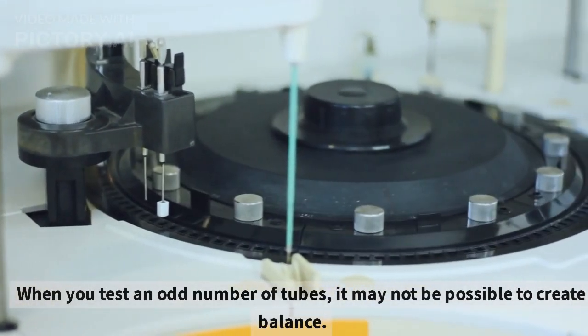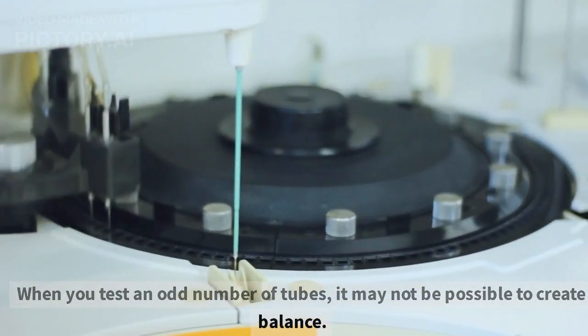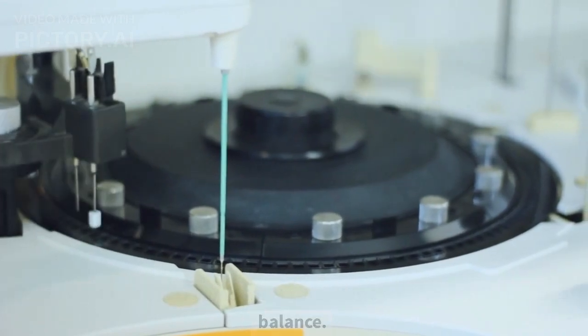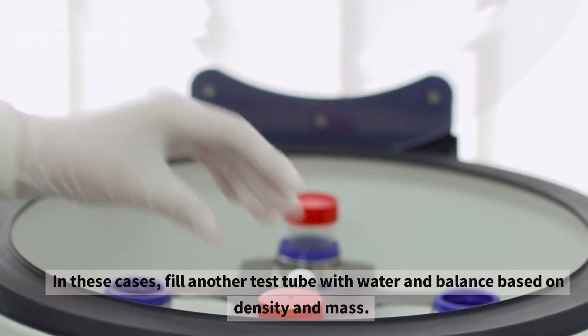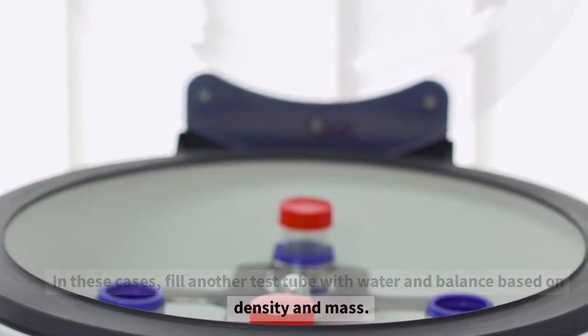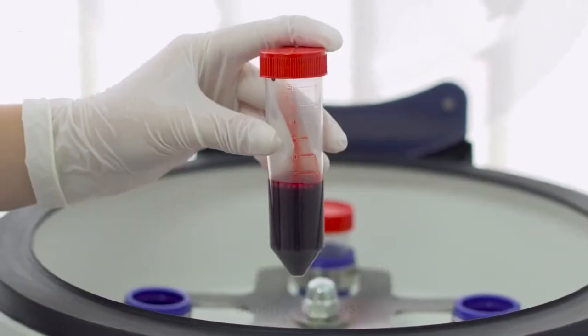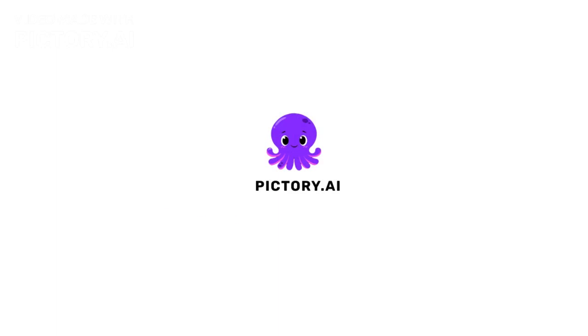When you test an odd number of tubes, it may not be possible to create balance. In these cases, fill another test tube with water and balance based on density and mass.